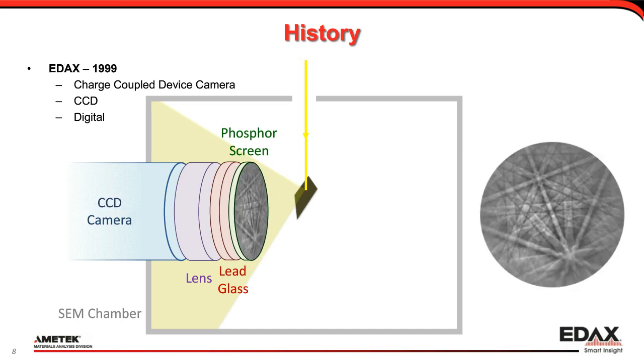Then late 90s, early 2000s, the SIT cameras got phased out, replaced by CCDs. Speeds started improving, starting again at 4 to 8 points a second. At some point, 32. That was the first real jump in the performance of EBSD.